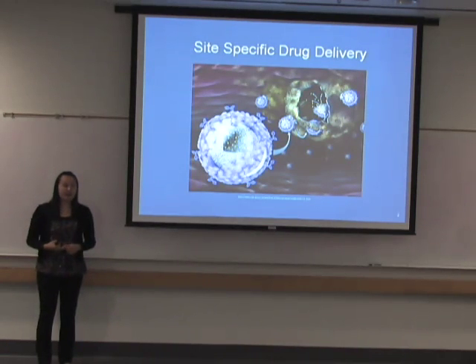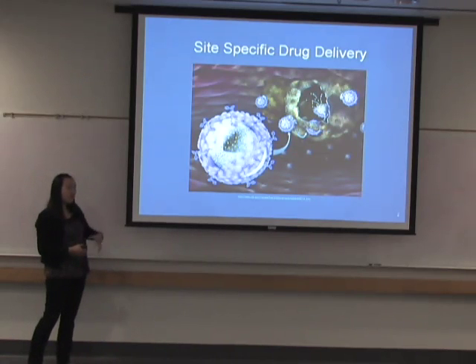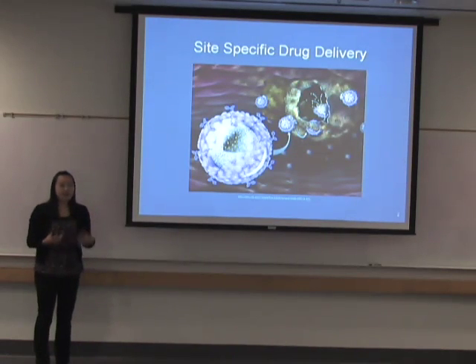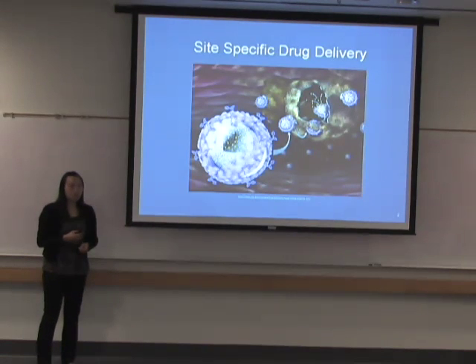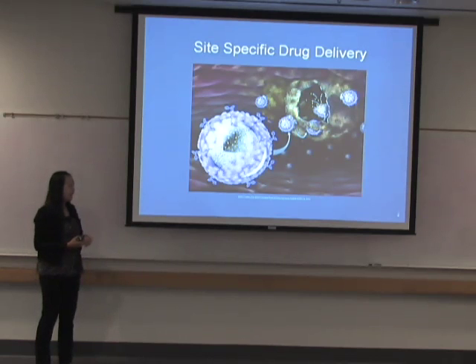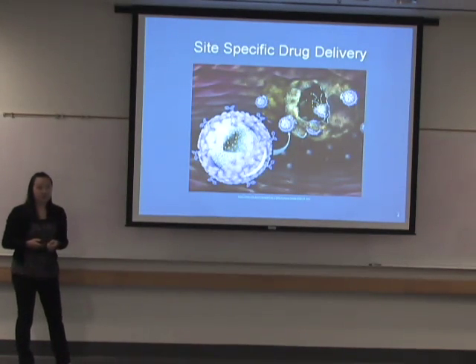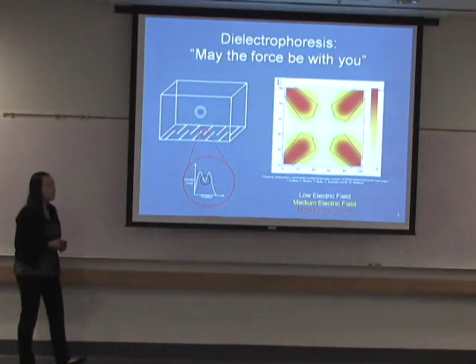So Avantika and I had the objective to basically simulate and model a method that will cause this particle to stay trapped when it's under observation in the microscope, even when there's fluid flow past it. So the method and phenomenon that we've been working on simulating is called dielectrophoresis.